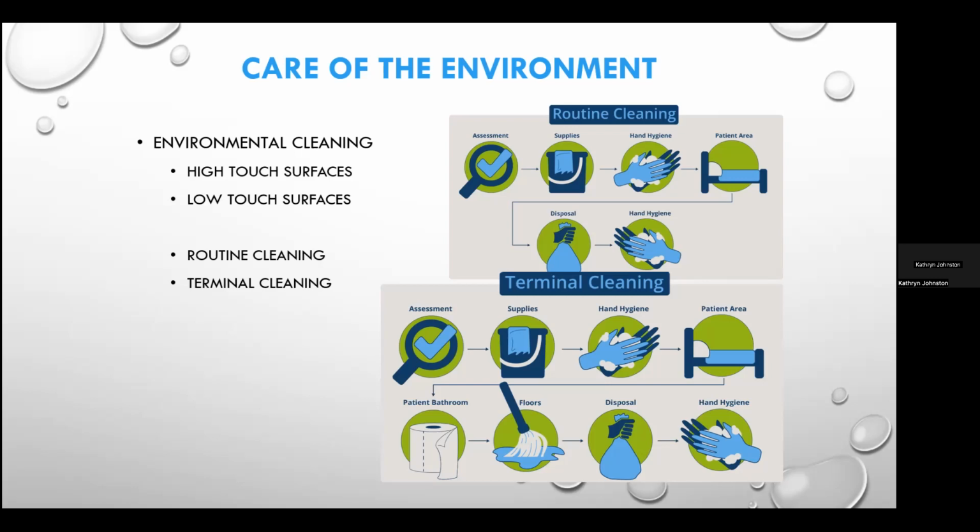In the lab, attention should be paid to additional frequently touched surfaces. So we're talking about not only the bench tops, but then also areas such as the cabinet poles, the operating keypads on the equipment and machines, and things like that. So those components in the laboratory setting, in the work area setting, which are frequently touched, should be cleaned more frequently.